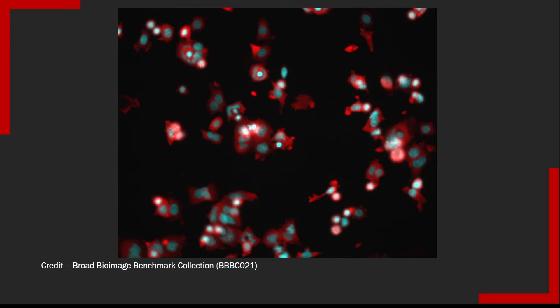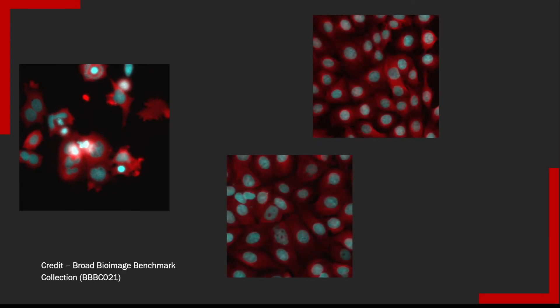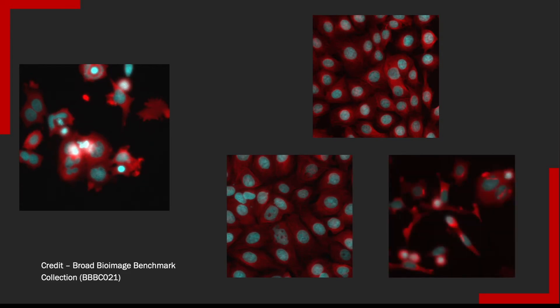Showing you this picture and saying what's going wrong in these cells, you might not immediately be sure. But if I show you this picture and say please compare it to healthy cells, cells with damage to their genes, and cells with damage to their cytoskeleton, you can probably see that the closest match is the cells with the damage in the cytoskeleton. So that's probably what's happening in those cells we didn't know what was going on with.